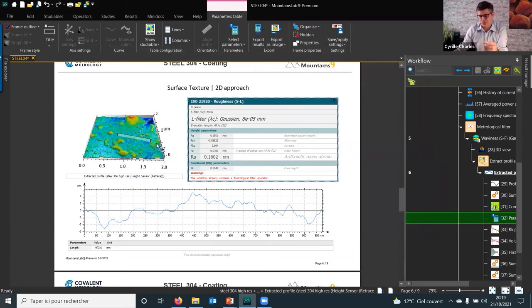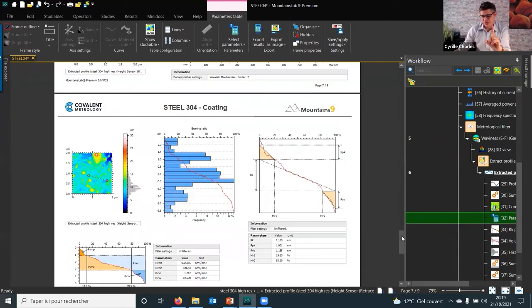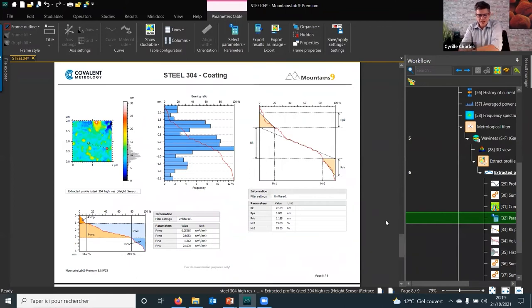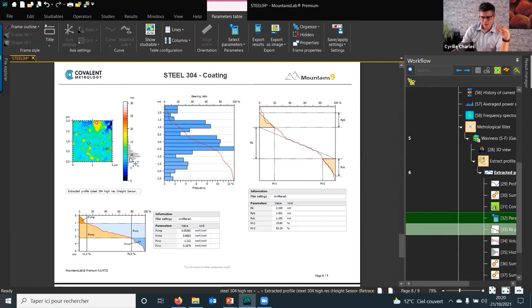There are many parameters that can be significant depending on what you want to quantify on the surface. For example, if you have a flat surface with some peaks versus a flat surface with some holes, the roughness RA may be the same, but if the surfaces are in contact, the tribological behavior will be totally different. On the next page I wanted to display more advanced analysis: diagrams, histograms, and curves. This profile comes from that surface. The histogram in gray shows the number of points — a lot of points in the lower-middle range, a few holes, and some high peaks.